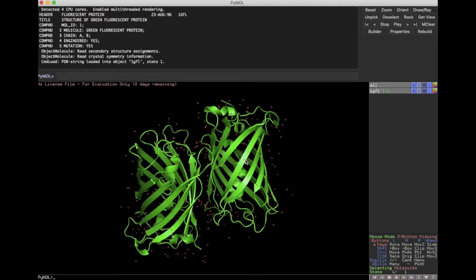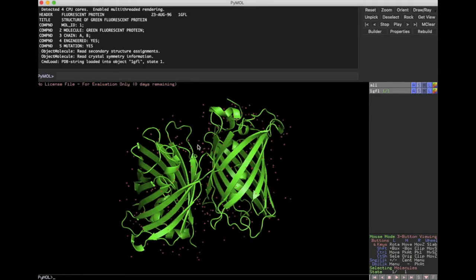And so in this video, I'm going to more or less go through how to select things within the loaded files that you have, because selecting the different molecules is really important if you want to manipulate certain parts of the system.